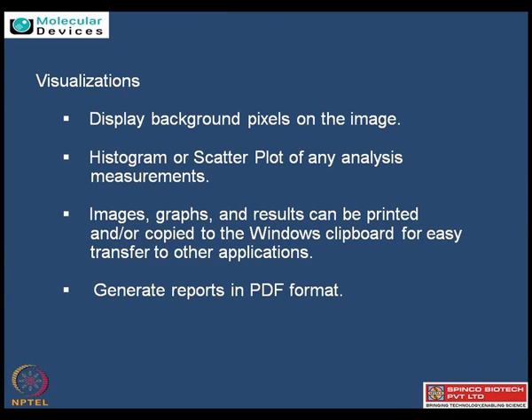And these scatter plots can be plotted against the channel type, say laser 1 versus laser 2, or wavelength 1 versus wavelength 2, in classical terms say Cy3 versus Cy5. So how these two have behaved for me. So again, different kinds of graphs, and the images can also be exported to PDF as well as being visualized in GenePix Pro for your further screening for different QC applications.